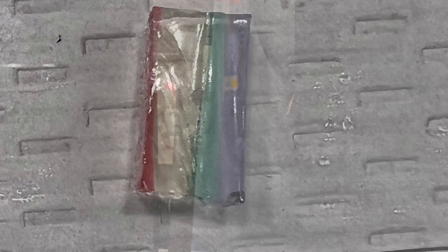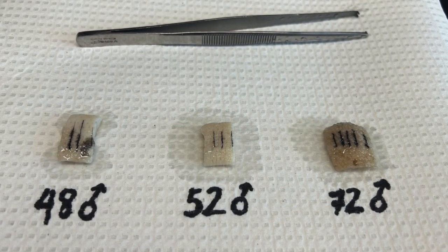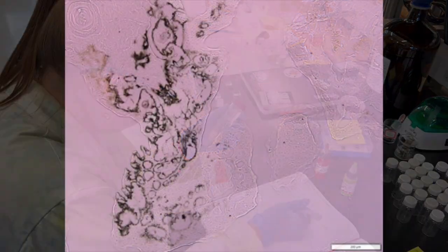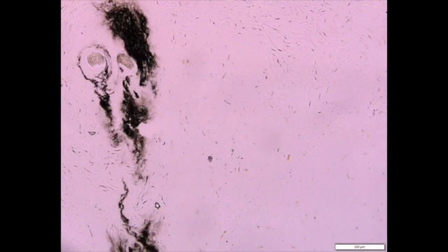This artificial skin can be tattooed and zapped by a laser for either shadowgraphy experiments, or sliced apart after exposure to the laser to study what happens to the tattoo pigments after being zapped. We also tattoo real human skin from cadavers, and then zap that skin with a laser to study the process of laser removal. By slicing the skin into thin slices, we can use microscopy and other techniques like Raman spectroscopy to understand how the tattoo pigments sit in the skin and then break down when exposed to laser light.